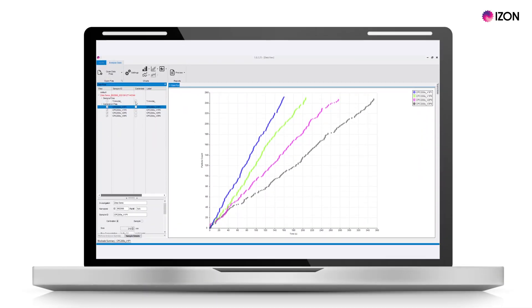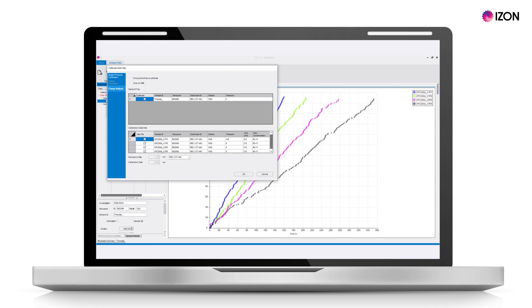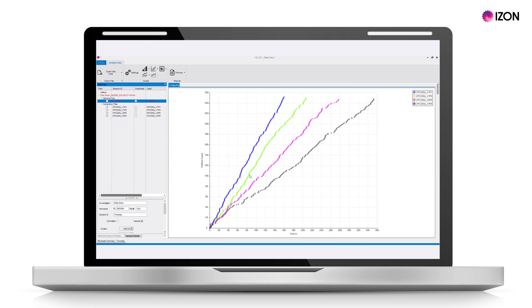Click on the button next to your sample in the calibrated column to bring up the calibration menu. The charge analysis button will be available if you have the required four calibration files in the dataset labeled V1P1, V1P0, V2P0, and V3P0. These files will be automatically selected to calibrate your sample with. Select the checkbox in the calibrate column for all the sample files you want to calibrate and click OK.